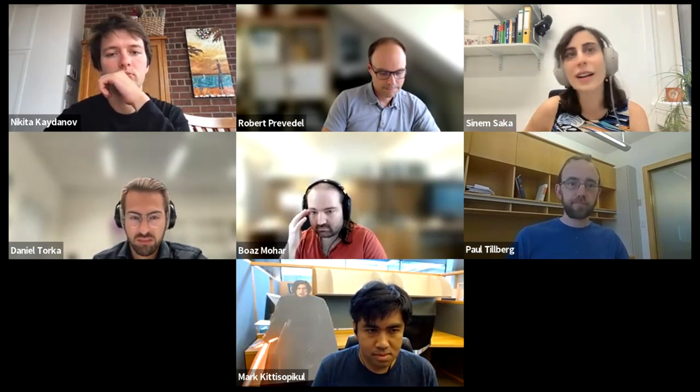So we have some advice on how to do these things, but we have a lot of people who use the help desk, who come up with their own applications and reach out for advice. So we are trying to support the potential users as much as possible, but there are a lot of kits, and I can give specific advice on what has worked best for us for the reagent generation. The concatemer generation itself is actually really easy, and we have very detailed protocols in the supplements of the papers, and we have a lot of people who successfully reproduce the concatemer generation without any problems as well.